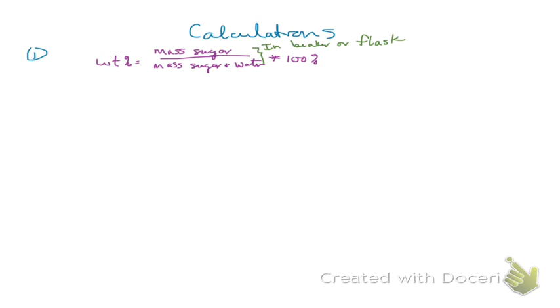So your first calculation is to calculate, in your A, B, C, and D, those sugar waters, the weight percent sucrose. So now I was at my desk, I'm like, how do I explain that? But if you look at your data, if we kind of look at it together, remember you guys are putting numbers where there's X's, right? So basically, it says mass of sugar, it's that first one, divided by mass of sugar and water, it's that second one, times 100% to get to parts per 100. Not too bad. Do this for each solution.